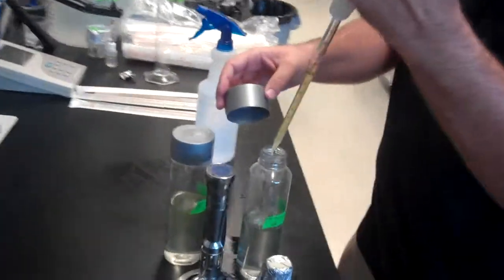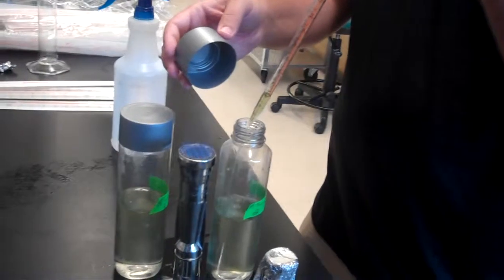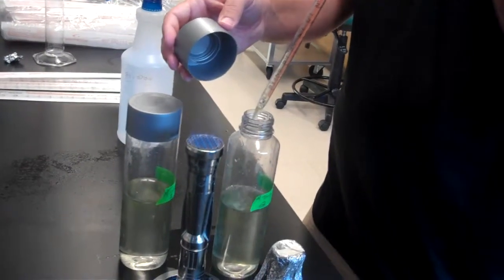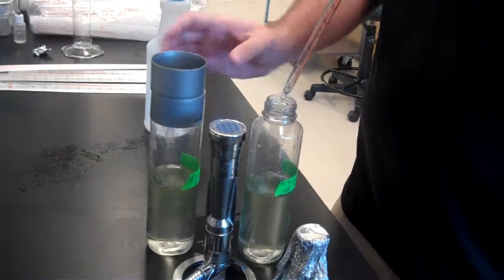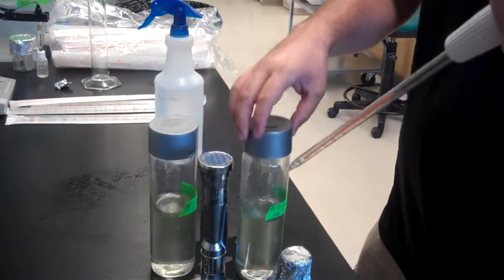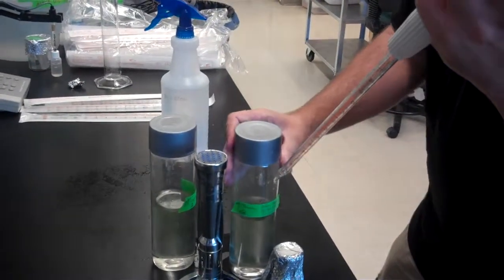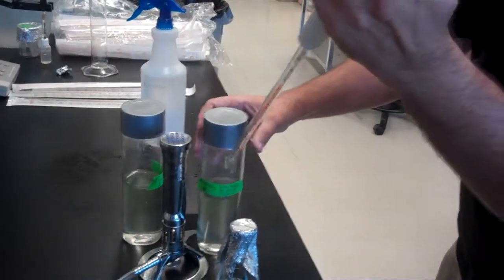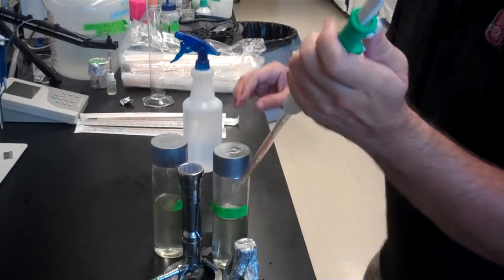Again, try not to touch the tip. Keeping the cap in the sterile field, so both hands are in the sterile field the entire time. If I need to stabilize it, I could always put the cap down upside down right here. We're okay. And now these are pretty much good to go.